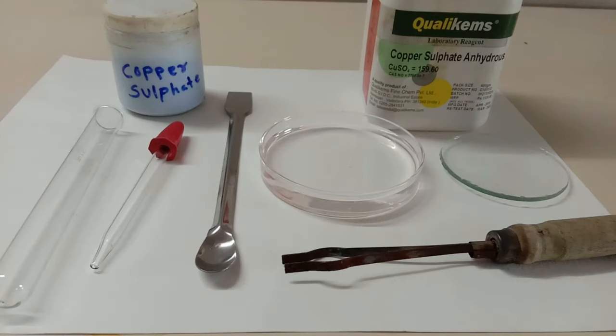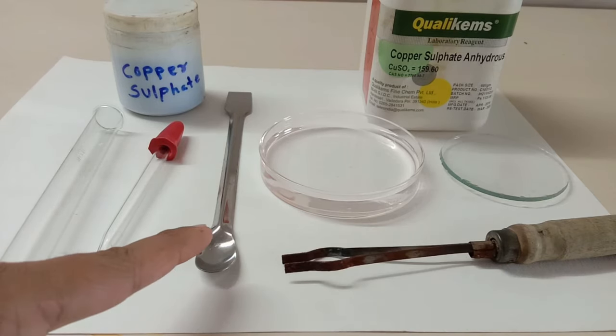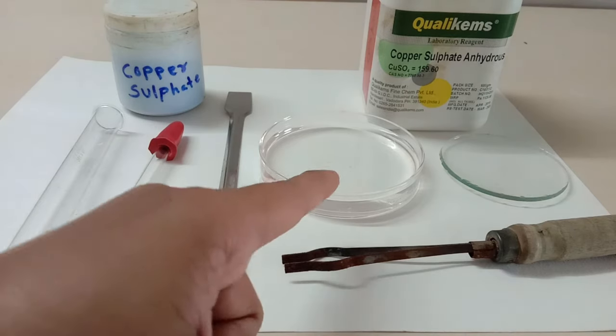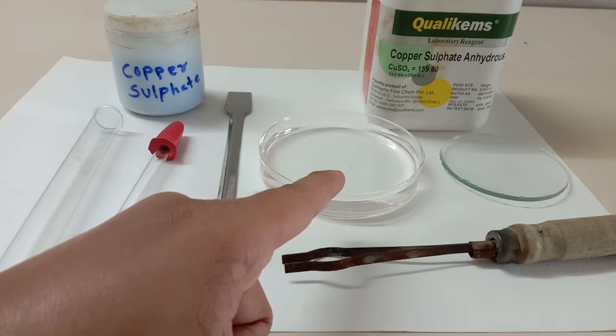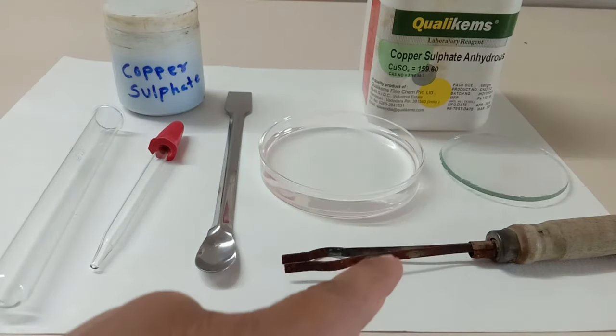We would also be requiring a test tube, dropper, spatula, some water in a petri dish, watch glass, test tube holder, and of course the Bunsen burner.